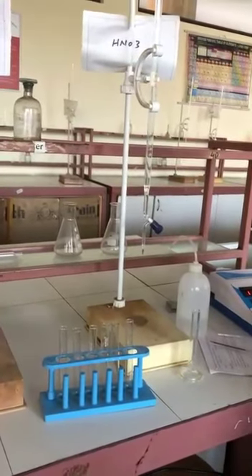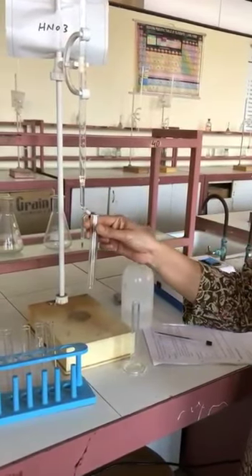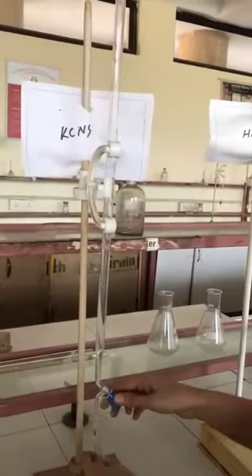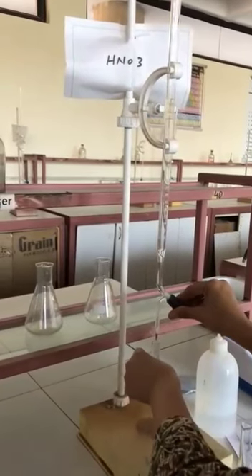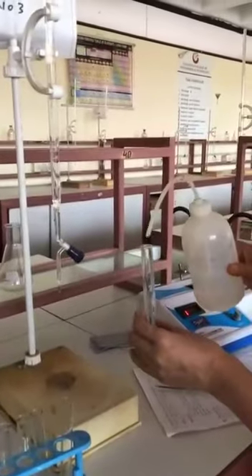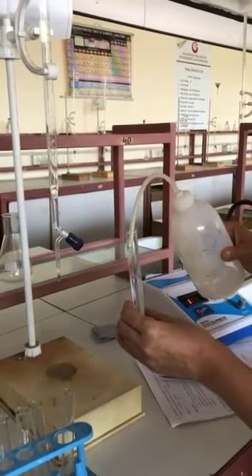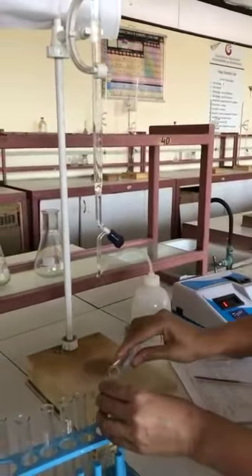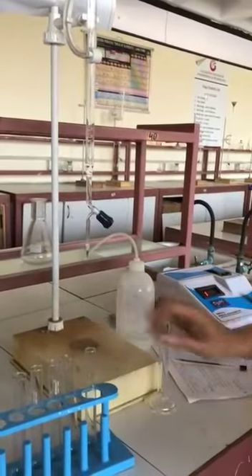6 test tubes for the experiment. For the first test tube, as we have given in the instruction that there is no need to add iron 3, we have to add only 0.5 ml KCNS, 1 ml HNO3, and with the help of a measuring cylinder, we have to add 8.5 ml distilled water. So this is the first test tube.